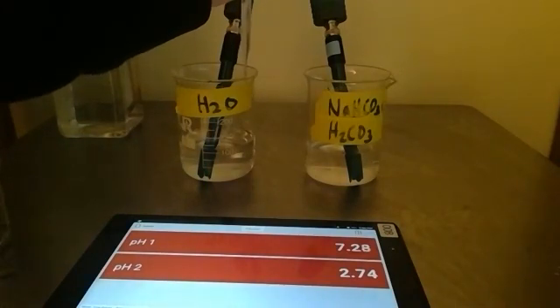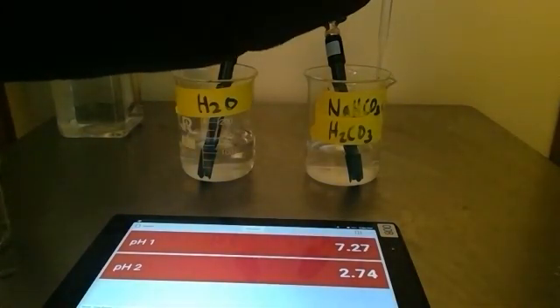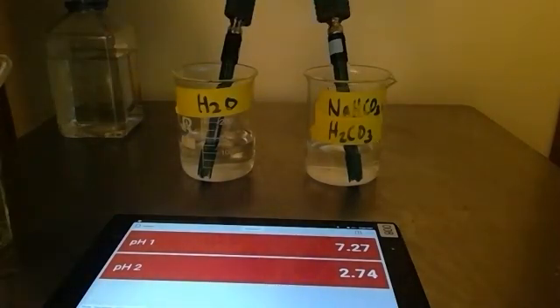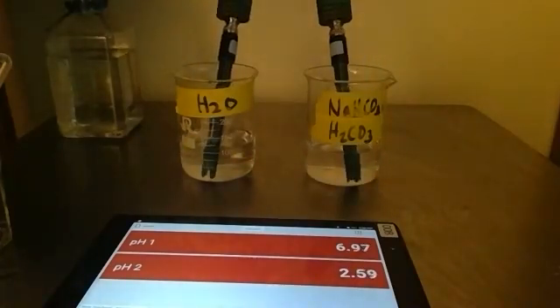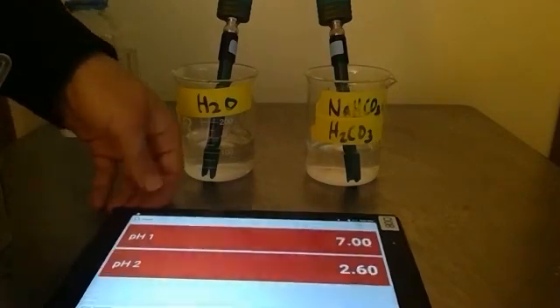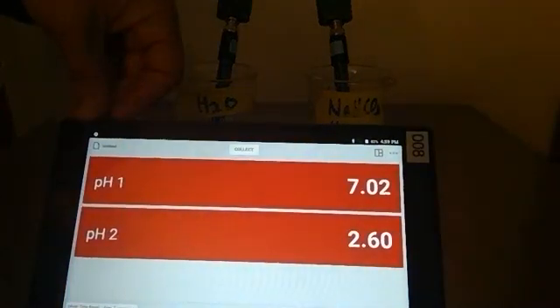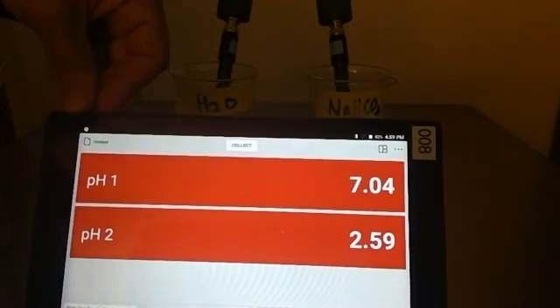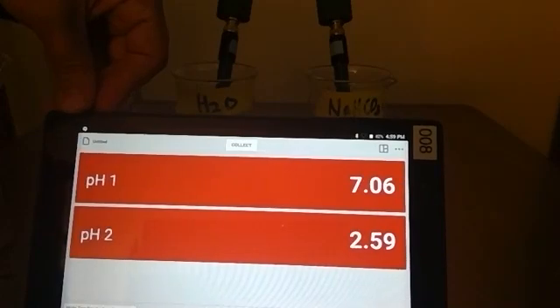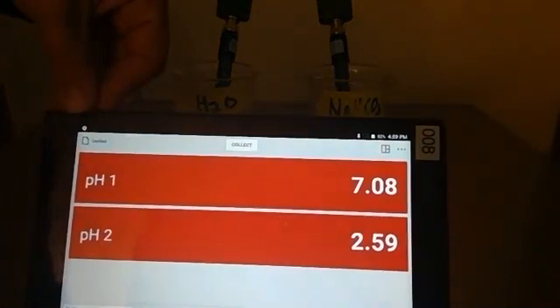I'm going to add another two drops to each and stir. We see a greater change now to the pH of our buffer solution. It's now at 7. I would not call this hitting its buffer capacity quite yet. We're hoping to see a dramatic change. We're at 2.5 for the pH of our water, and 7.08 for the pH of our buffer solution.